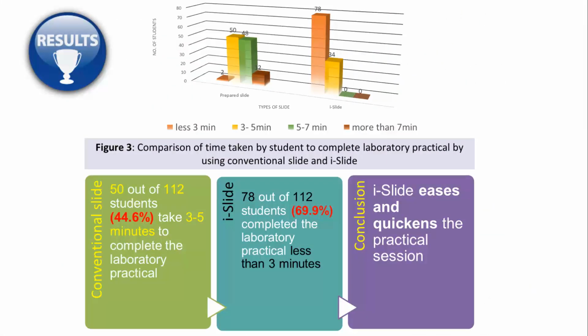50 out of 112 students take 3 to 5 minutes to complete the laboratory practical by using the conventional slide, while 78 out of 112 students complete the laboratory practical in less than 3 minutes by using iSlide. So the conclusion is iSlide eases and quickens the practical session.